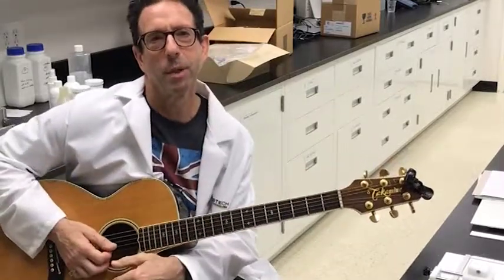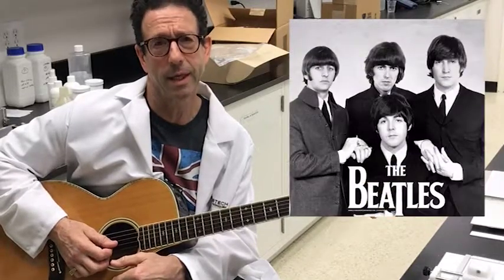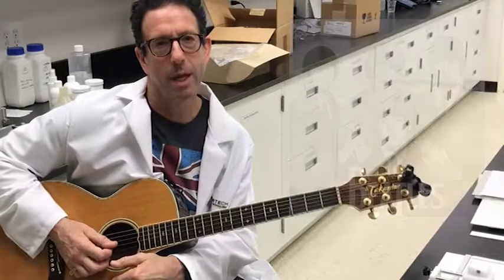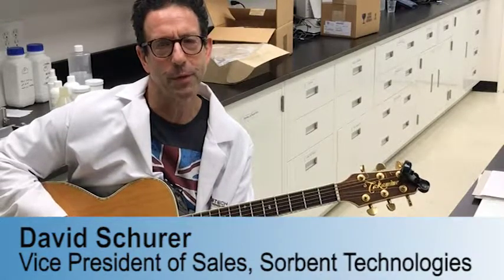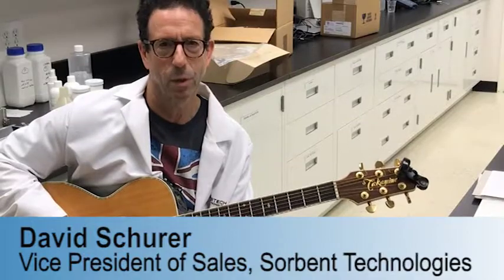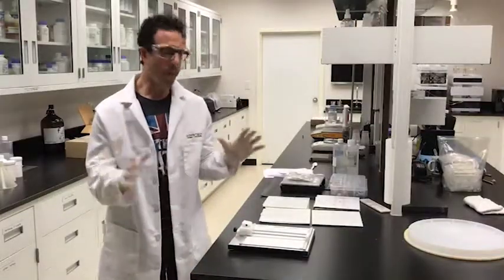Today we're going to talk about cutting glass TLC plates — how to do it the best, most efficient way so you don't waste material or hurt yourself. Let's begin.